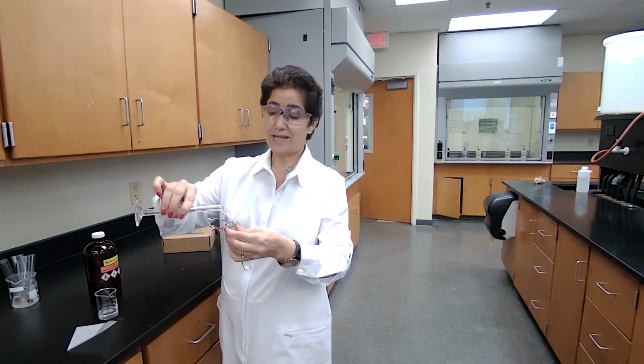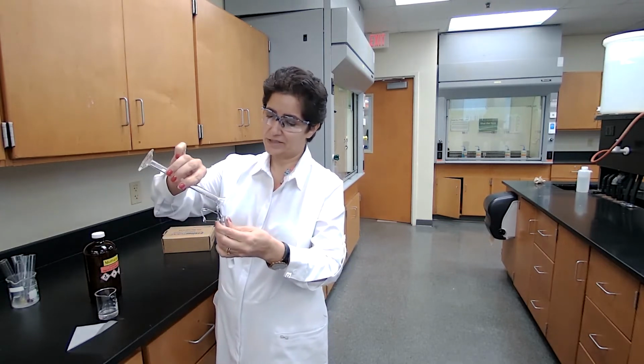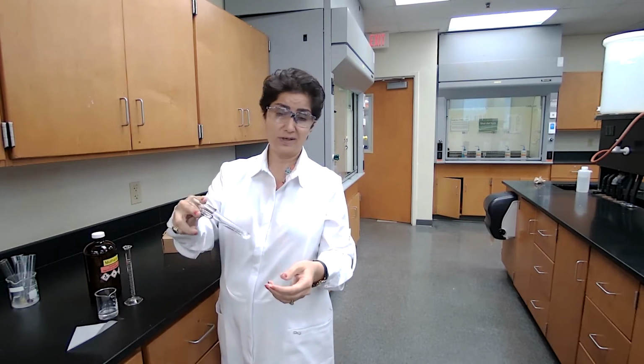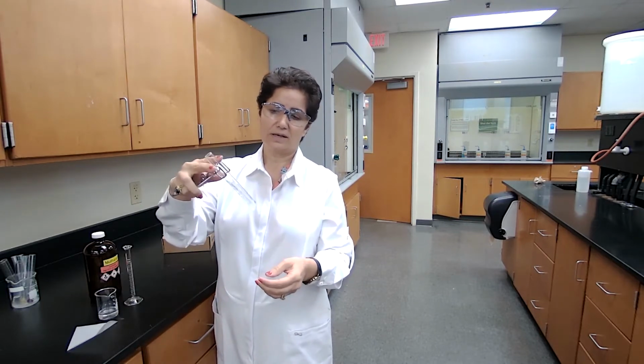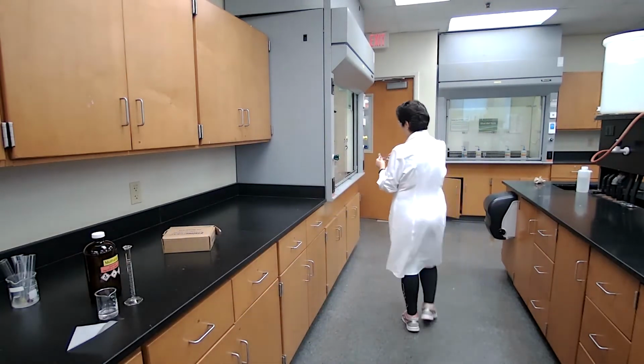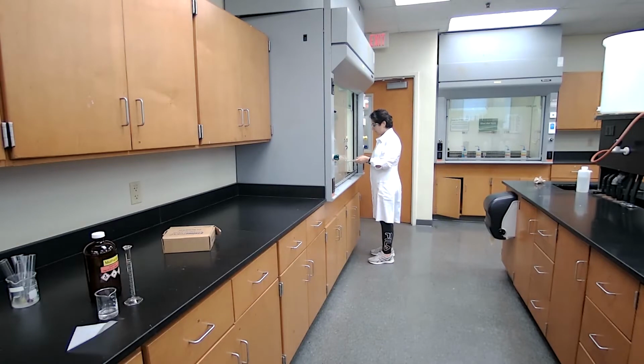This reaction could happen, but it's a very slow reaction. So that's why we are adding the catalyst of sulfuric acid. Sulfuric acid is concentrated, so I'm going to add that in the fume hood, just 5 drops of concentrated sulfuric acid.